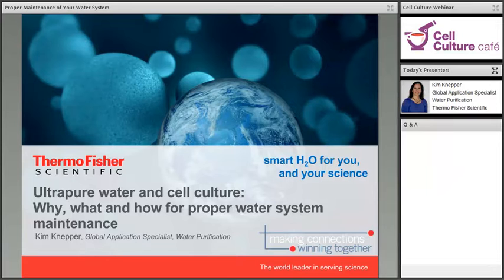Thank you, Megan. Your water system in your lab is expected to deliver ultrapure water consistently. So this webinar is to help you understand your system and to be a little proactive to avoid problems with the water system and any interruptions to your daily work.